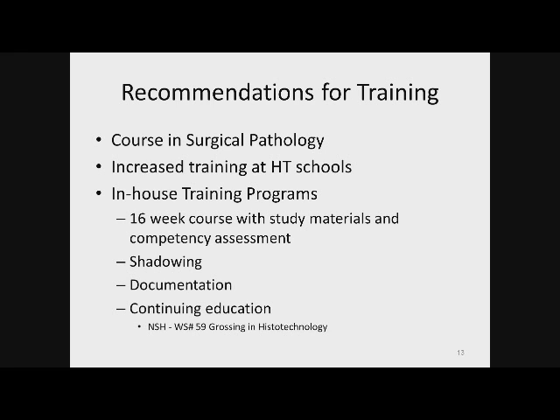Now, one of the problems with increased training at HT schools is that HT schools have already increased training in areas such as in situ hybridization, immunohistochemistry, and other high complexity testing. So to include grossing in that may be beyond the scope of what the HT school's target is. And again, since it's not covered specifically on the Board of Registry, it's not something that most HT schools are going to be interested in covering.